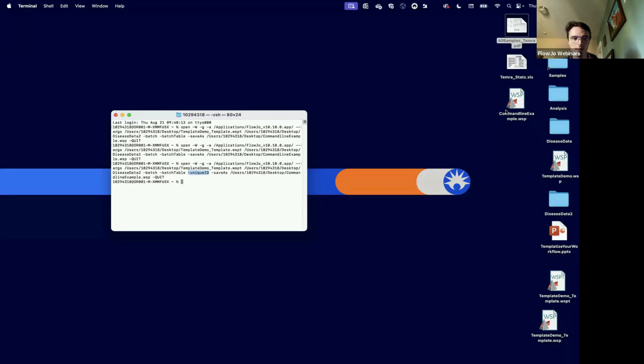So that, though, was an overview of how to run FlowJo headlessly using those templates. If there's any questions about anything, I know we're kind of at the top of the hour, but feel free to drop them in the chat and I'll stick around.